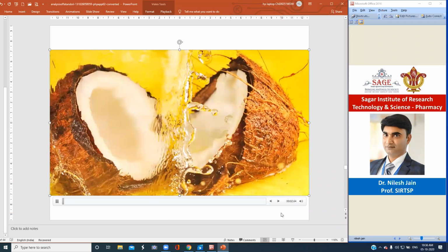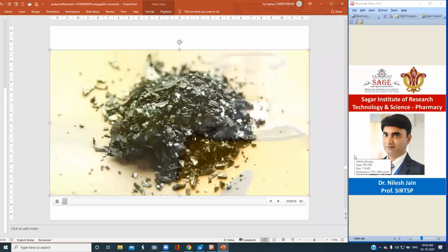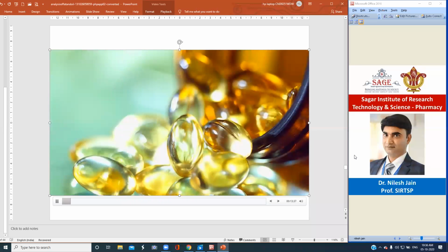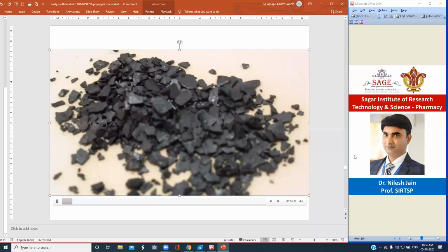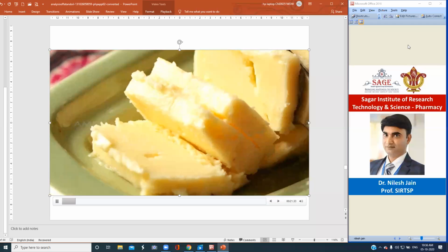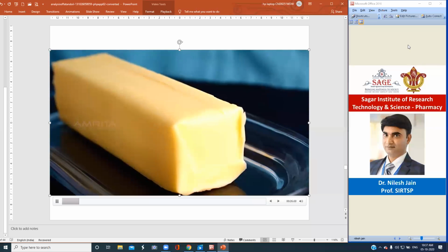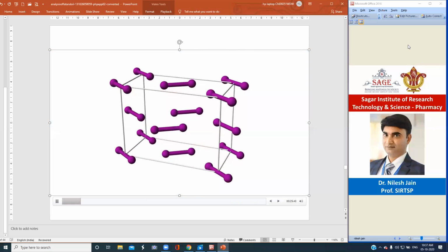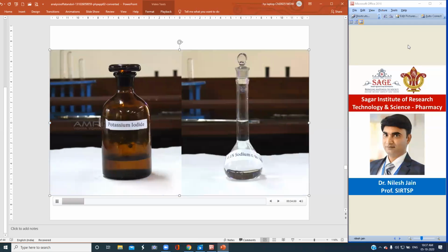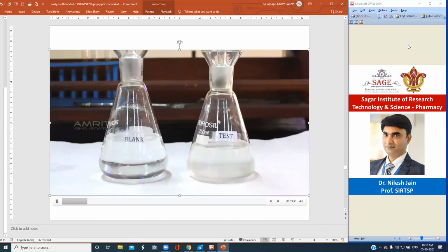The iodine value is a measure of the degree of unsaturation in fats and oils. The iodine number or value is defined as the number of grams of iodine consumed by 100 grams of fat. The principle behind the reaction is the addition of halogens like iodine to the double bonds present in the unsaturated fat. The iodine monochloride reagent is allowed to react with fat in the dark. The amount of iodine consumed is then determined by titrating the iodine released on adding potassium iodide with standardized sodium thiosulfate solution and comparing it against the contents in the iodination flask labeled blank.